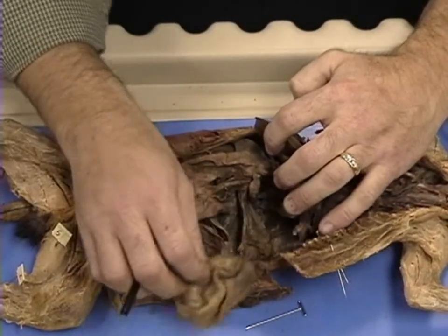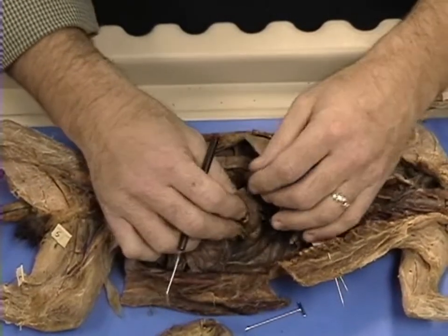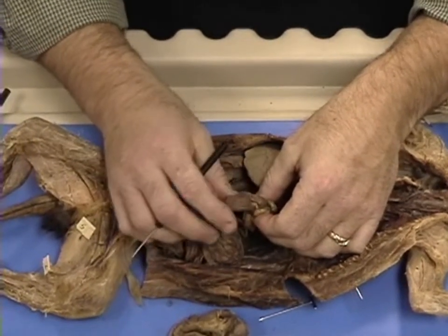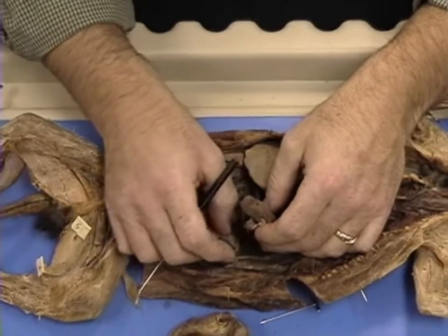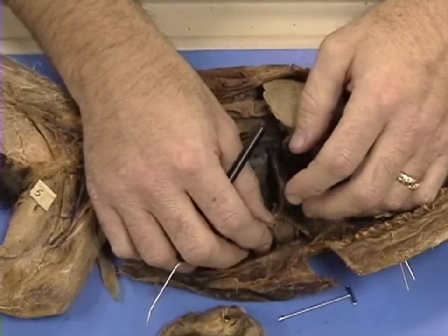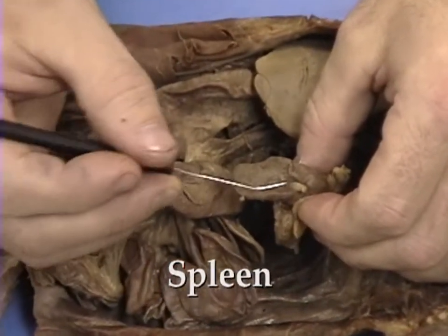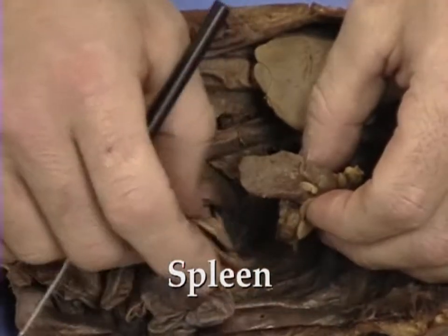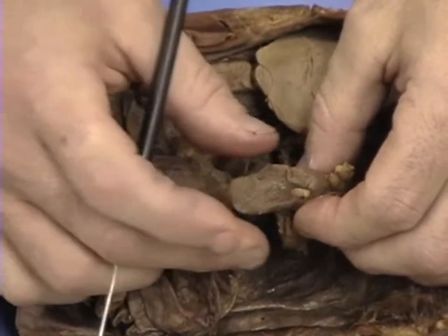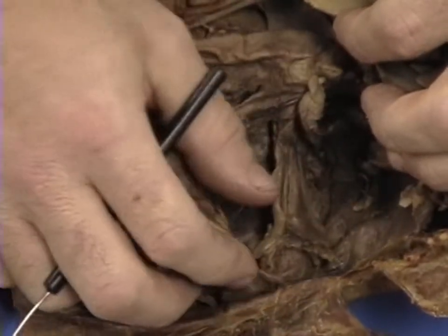If we move the stomach aside for just a moment, there's a couple other organs I would like for you to examine. First of all, this organ here. It's a little tougher, a little denser organ, and the organ itself lies on the lateral wall of the cat, on the left side of the cat. This is the cat's spleen. Some spleens will be larger than others depending on the conditions of the cat when we receive them. This is the spleen. It will lie lateral to the stomach up against the wall.